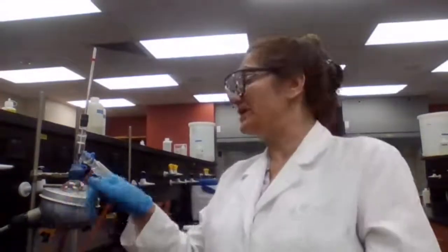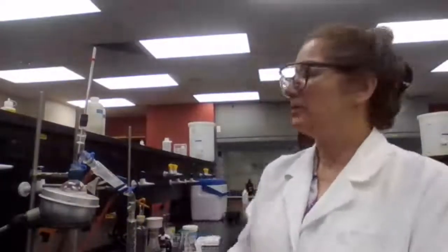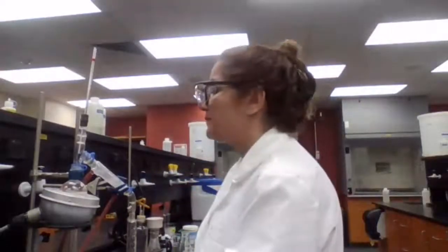I did set it at 80 at this point, but I'm waiting for the boiling. When it starts boiling, then I'm going to lower it for gentle boiling. So at this point, I just set it between 80 and 90. But when it starts boiling, then I lower the setting.